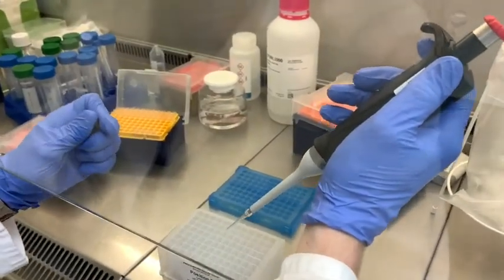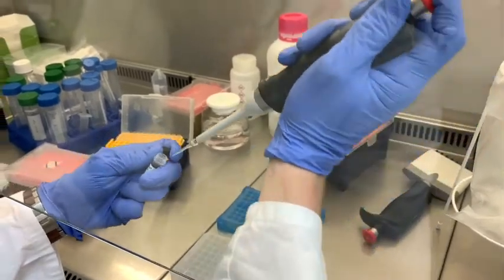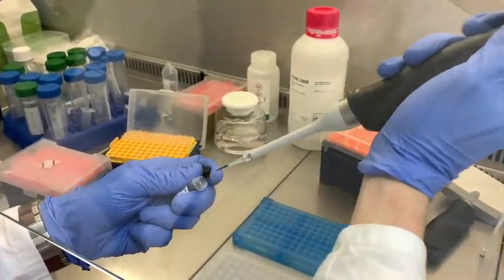In the lysis buffer well, we will now pipette 10 µL of the magnetic beads into each well.